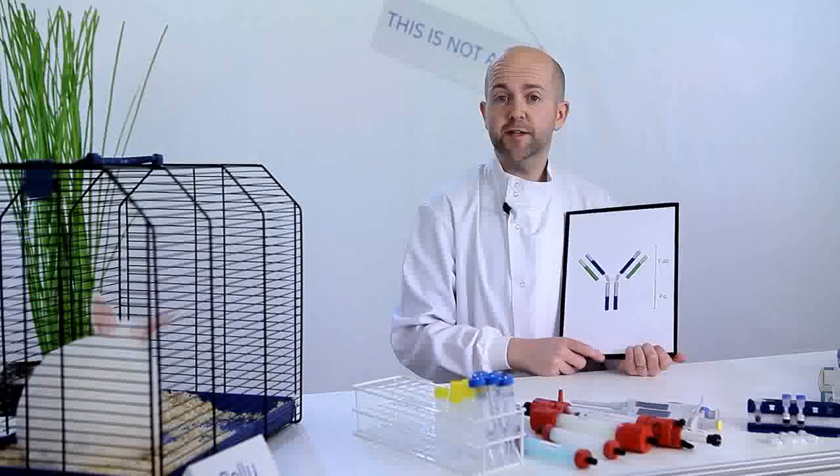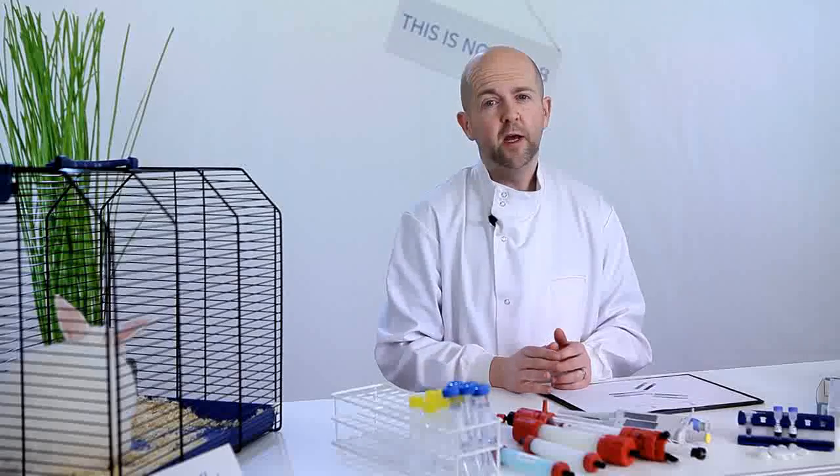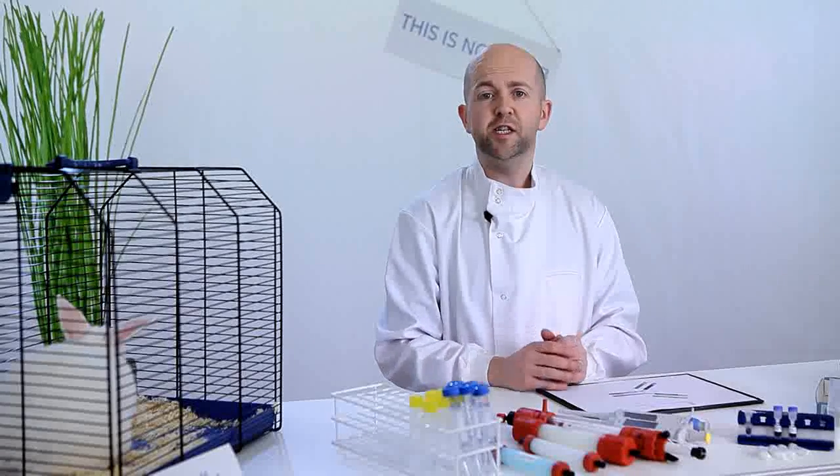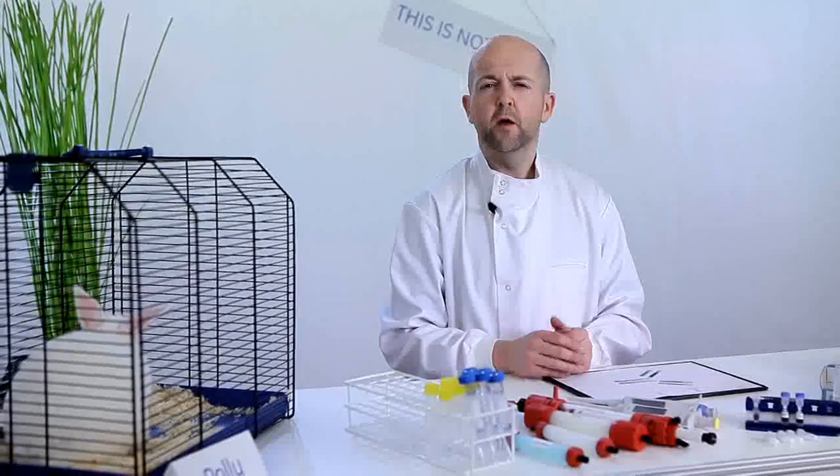Mike's first tip: it is straightforward to decide when to use Protein G or Protein A. As long as your antibody has the Fc region, Protein A and G can be used for purification. If there is no Fc region, then an epitope tag is needed. Protein G is the first choice for general-purpose capture because it binds a broader range of IgG from eukaryotic species and more subclasses of IgG than Protein A, usually with greater efficiency. Protein A, on the other hand, has a much narrower range of applicability; however, with some subclasses of IgG it can bind better than Protein G.